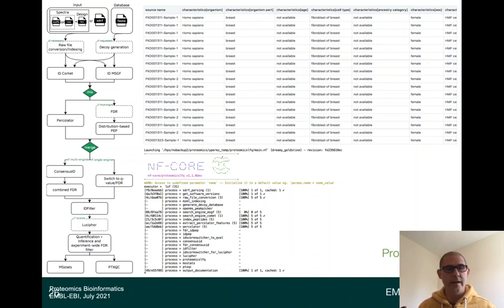It depends on the analysis that you do. And we have a really nice tool on top of that. If you're doing phosphorylation, phosphoproteomics data analysis, we use Luciphor to try to give a probability that one specific site in a peptide, a phosphosite, is true or false, and then give you a probability that this is the correct site for each phosphorylation.